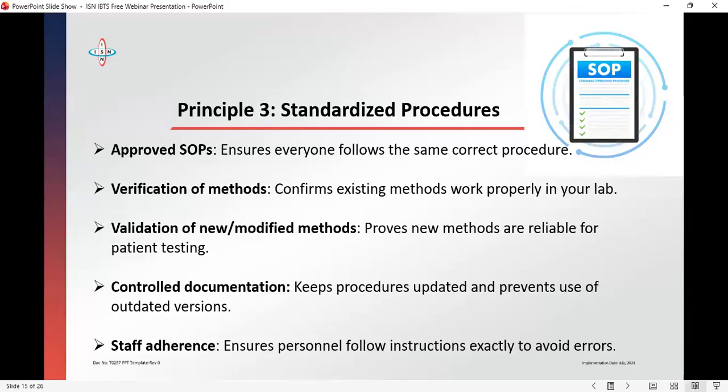Principle 3, we've mentioned standard operating procedure. Who writes them? It should be the people working on the bench. If you have an instrument, you should have a standard operating procedure of how to operate that instrument. Everybody must be aware, especially the stakeholder. You can take the most senior and the most junior person, form them as a team.